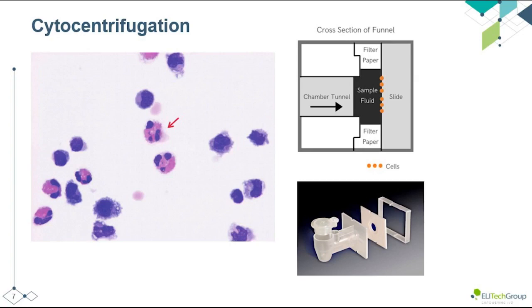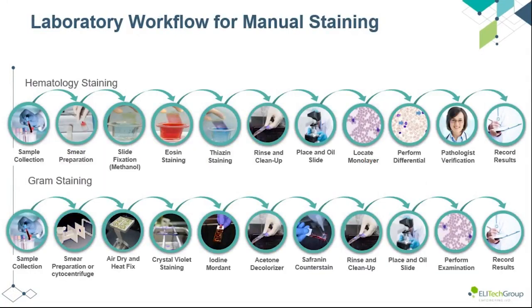Keep in mind that due to the forces, there will be some deformation of the cells as seen in this image of eosinophils in CSF fluid. Once you have a slide, now we have to stain the slide.